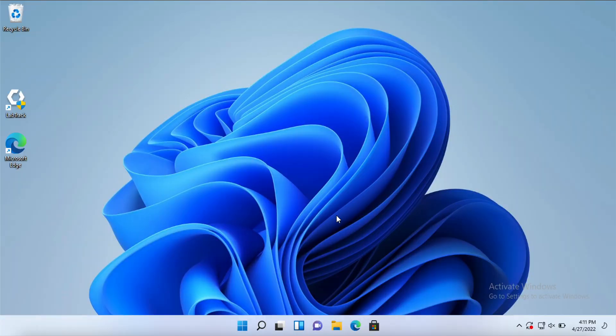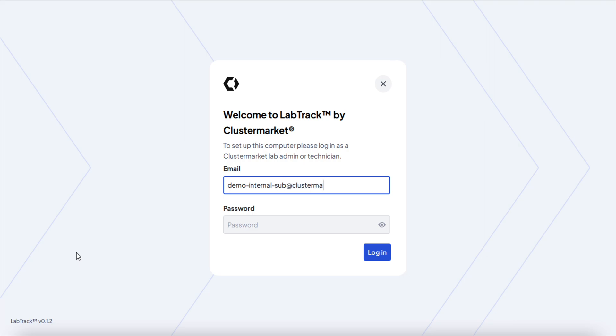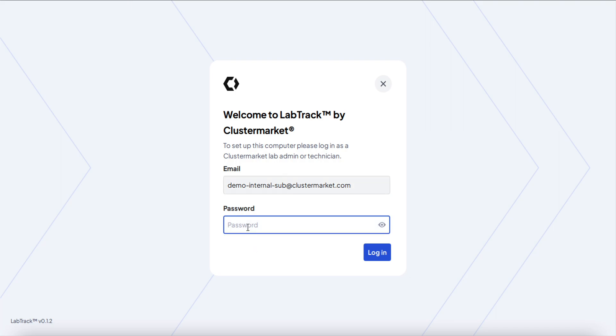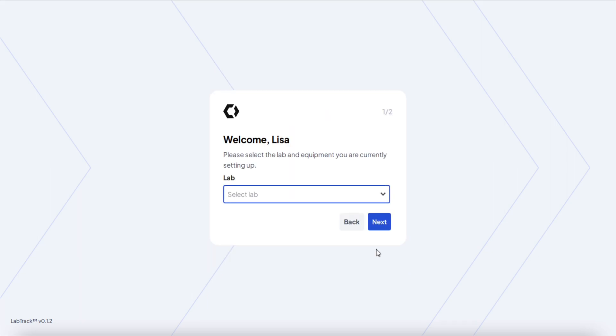To log in, you need to be an admin in order to set up the app. I'm going to log in with our demo admin account because this is the account that will allow you to choose the equipment and the lab that you want to connect to this PC. That's the same email and password that you have on your browser when you normally log into Clustermarket, and then you log in.